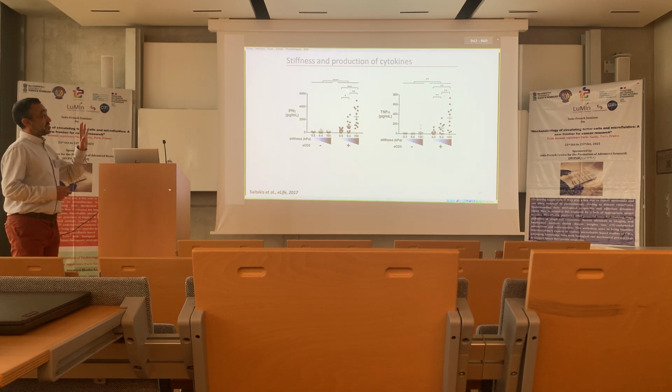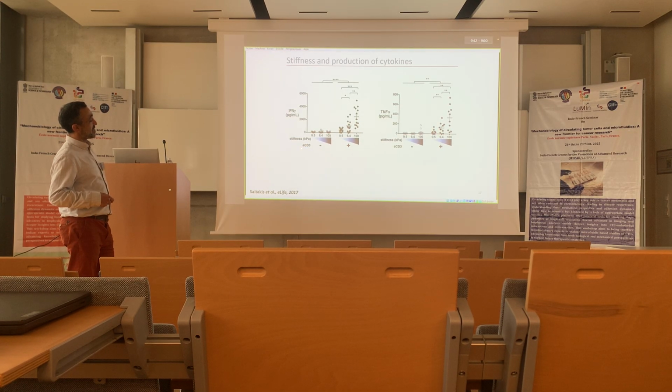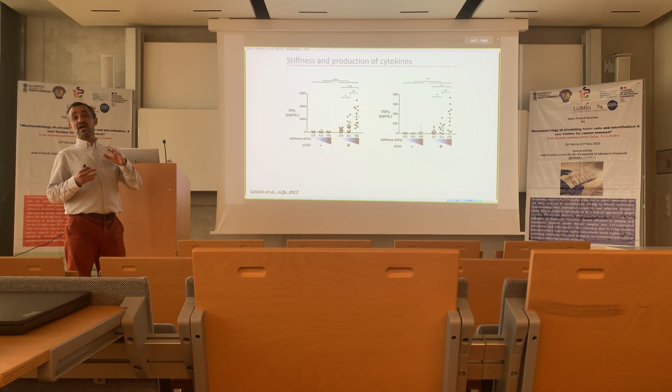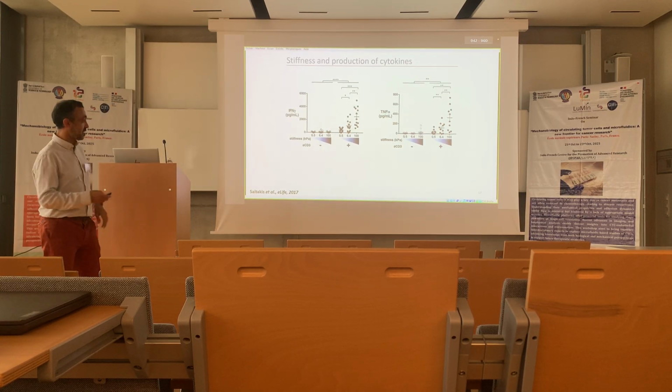Here we're just interested in cytokine production by these T cells, and you have on each graph interferon gamma or TNF alpha, and in each case you have plus and minus, and this is about the antibody, anti-CD3. So you are either targeting specifically the T cell or not, from the biological point of view.